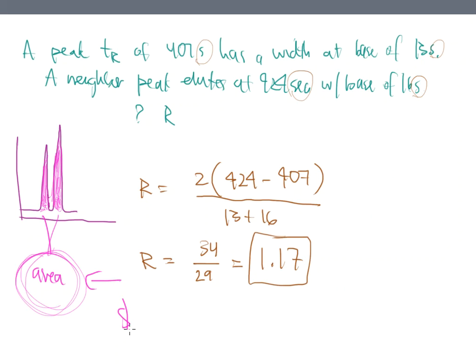So time is money and money is time. And you don't want to waste my time, and I do not want to waste yours. So for that reason, always keep that in mind. We don't want chromatograms that take an hour and a half to process per sample.